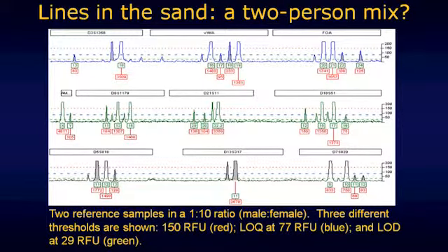And if you're wondering, is it worth the trouble? I mean, does it have a practical application to dealing with DNA testing results? Well, let me suggest this. Let's consider this slide. We have here a sample that we know is a mixture. It comes from a testing laboratory's validation studies. It's a 10-to-1 mixture of a female's DNA to a male's DNA. We know it's a mixture.